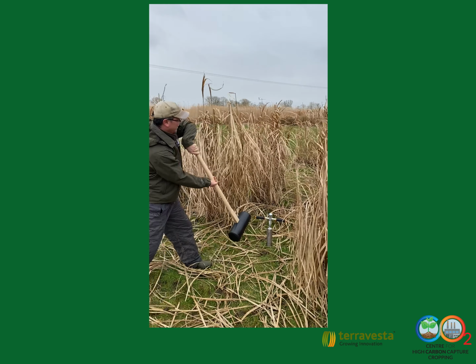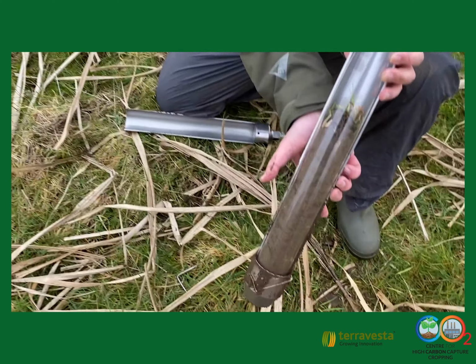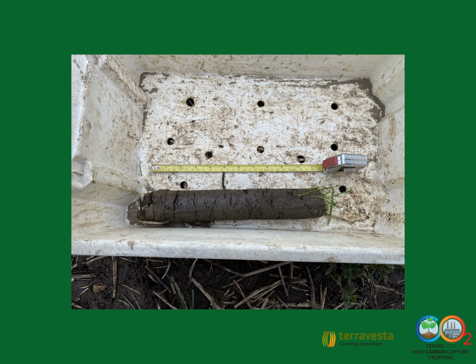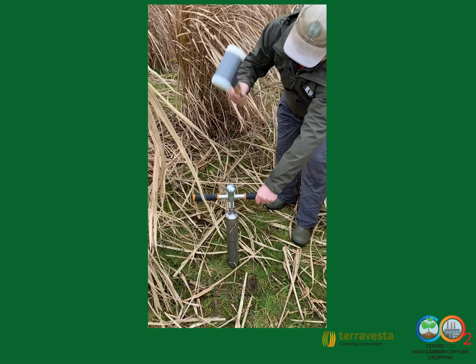Hammer the core into the soil until it reaches a depth of 30 cm from the surface, remove it from the soil, and then remove any surface debris, roots, or large plant matter, but do not take out any stones or gravelly material. Check the core length at 30 cm and then place the soil core into a bucket. Then repeat the aforementioned steps for the second 0 to 30 cm sample in that plot.